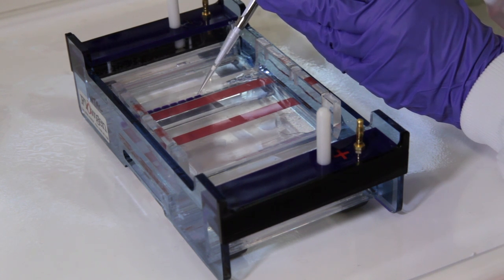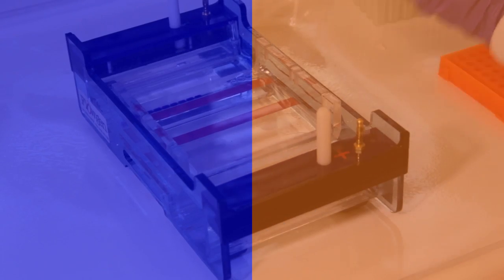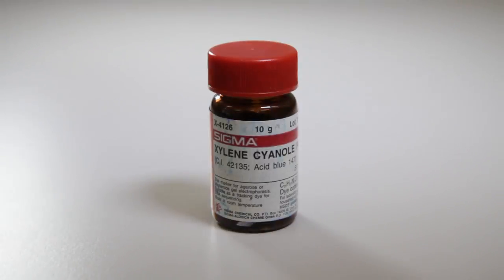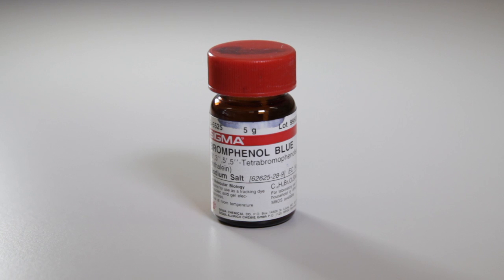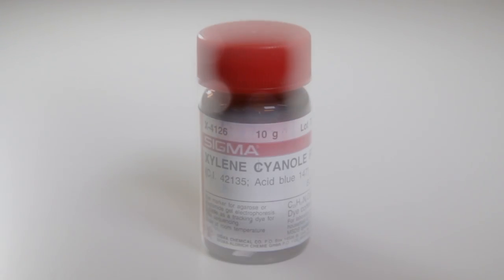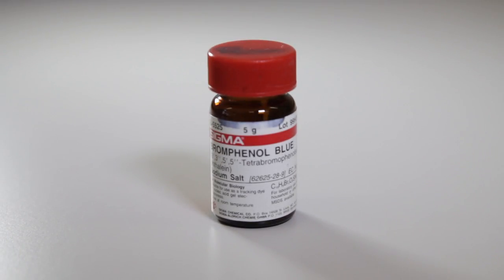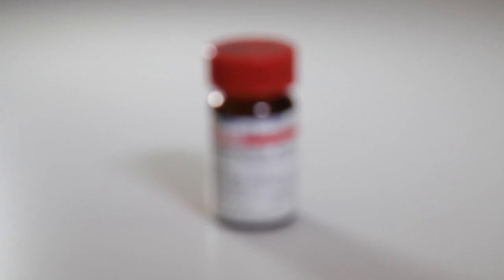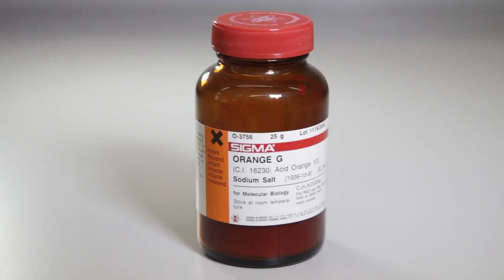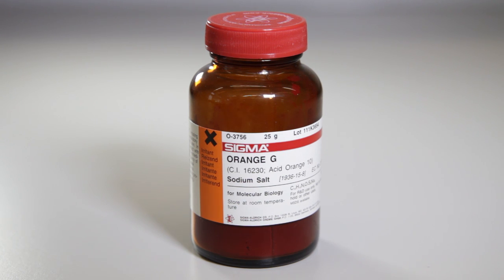Two kinds of loading dye are usually used, blue and orange. The blue dyes are xylene cyanol and bromophenol blue. The xylene cyanol dye runs at about 4000 base pairs in a 1% gel but this varies with gel concentration. Bromophenol blue is smaller in size and runs at about 300 base pairs in a 1% gel. Orange G runs right at the front at around 50 base pairs.